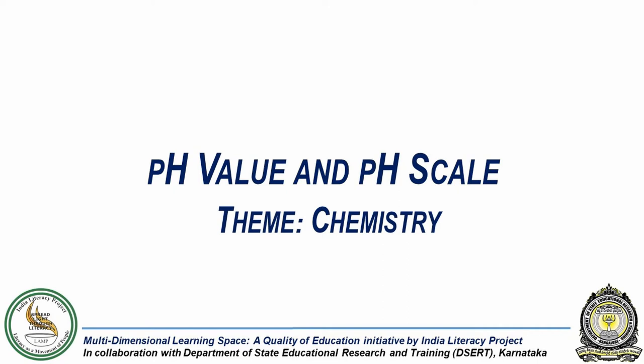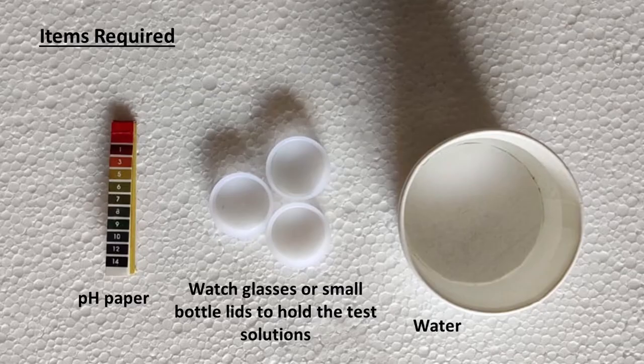In this experiment, we will test the pH value of some test solutions using pH paper. For this we will need pH paper, watch glasses or lids of small bottles to hold the test solutions, and water to prepare aqueous solutions.